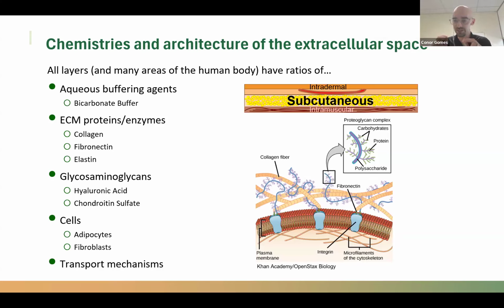But if there is a specific tissue and a specific enzyme, that is not a barrier for Pion or for the SCISSOR instrument, frankly. As long as the material can be sourced, it can be integrated within the artificial ECM.